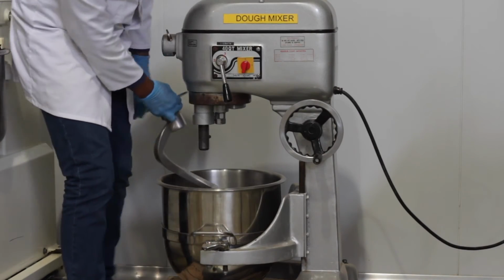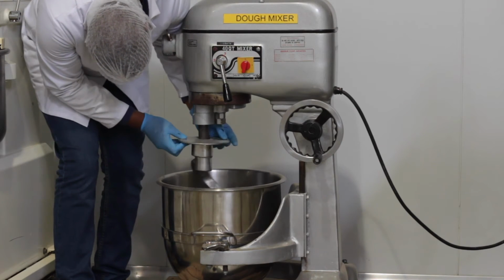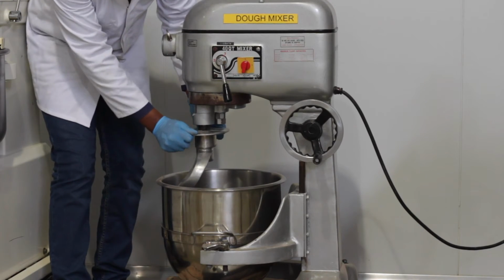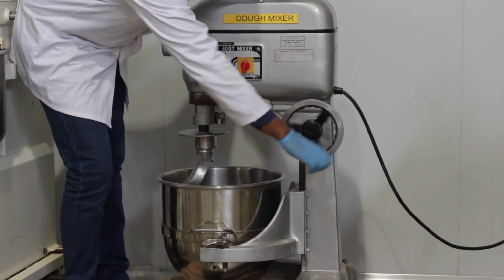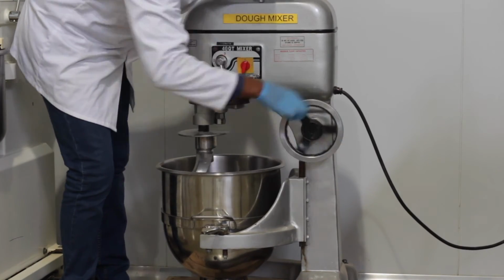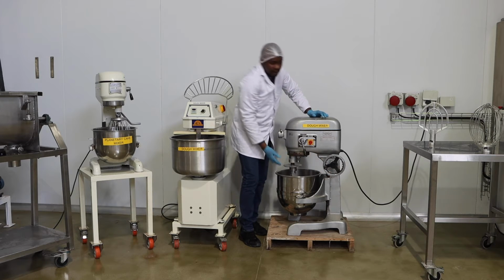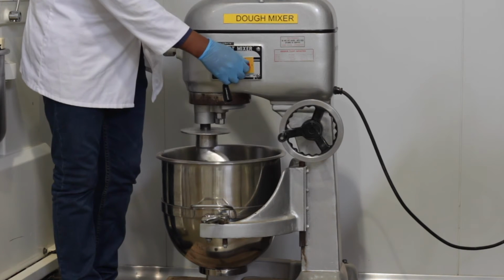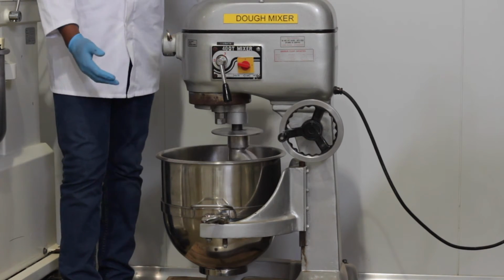Right, so this is now in, so it's not going to move. Then you can move your thing up until it reaches the level where the product is, and then we can switch on the machine. So this is basically how this type of machine works.